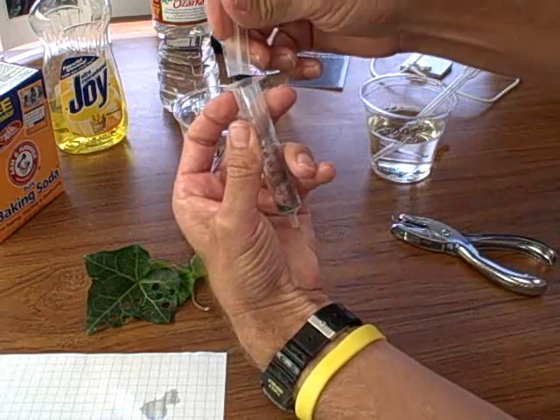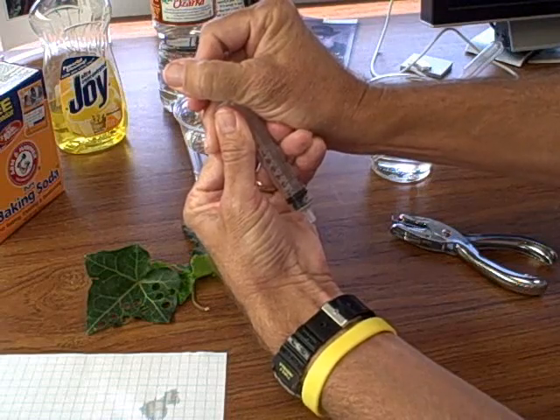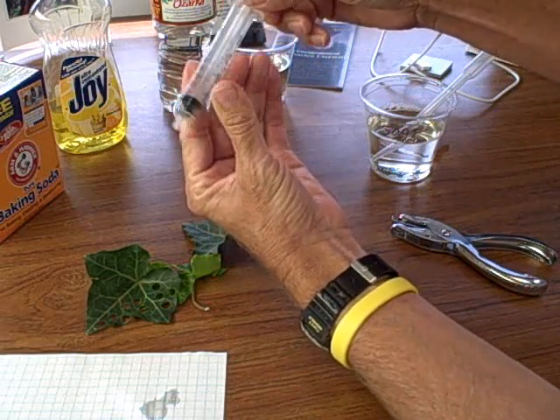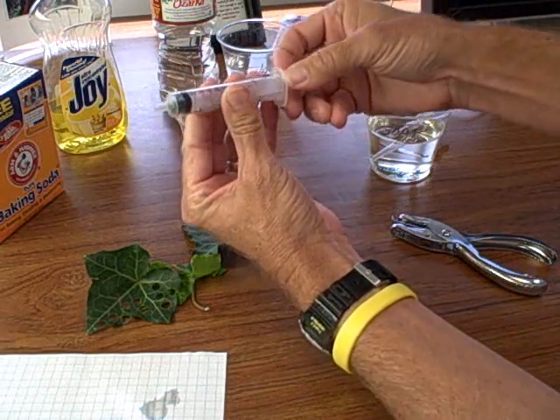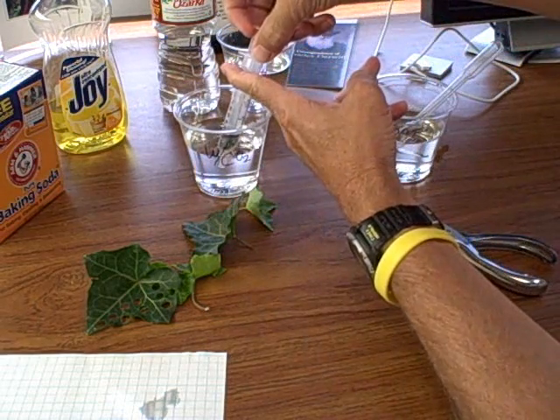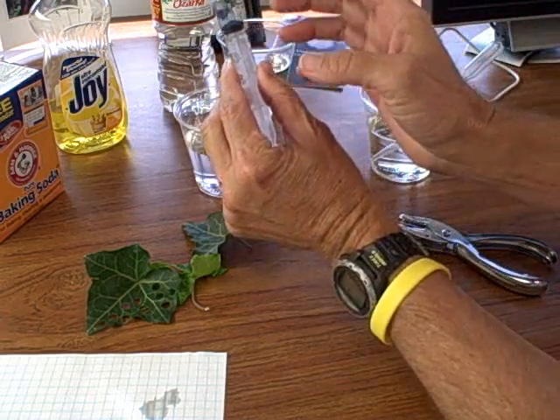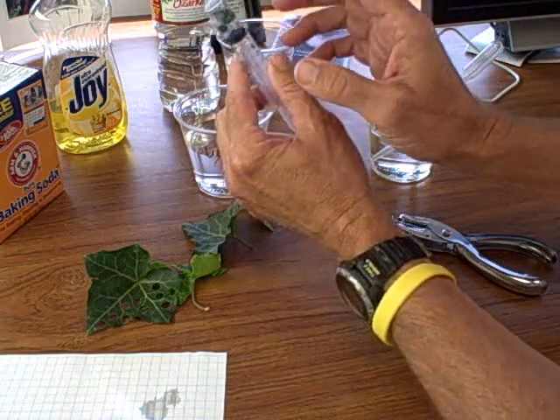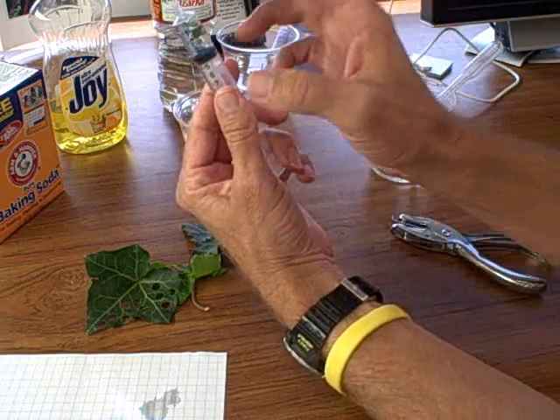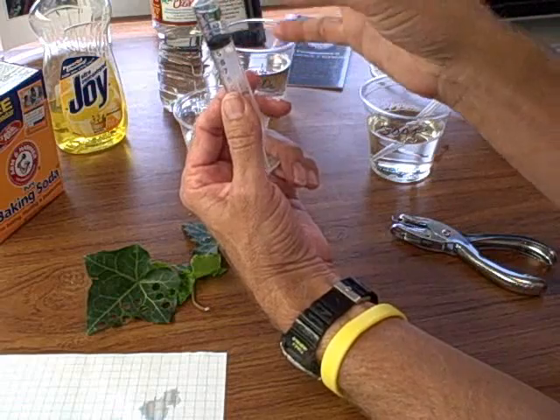Then we add the plunger. Notice I don't squish the discs — I don't put the plunger in so far that I damage them. Now I'm going to pull up my infiltration solution, only about two or three centimeters, and I've given it a little click around to saturate or at least wet all the leaf surface.